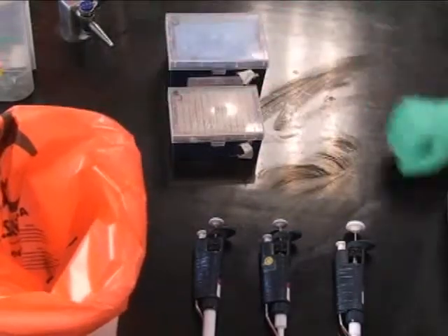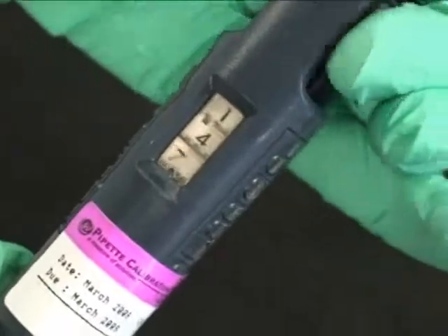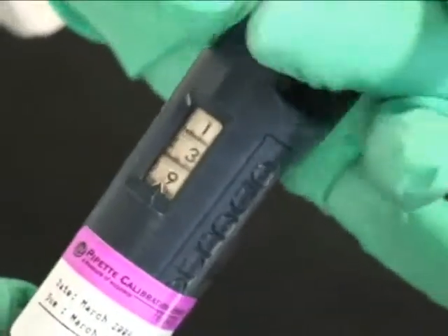This is where to dispose of used tips. To adjust the volume of a pipetter, turn the dial until it reaches the desired number. Do not go out of the range of the pipetter.